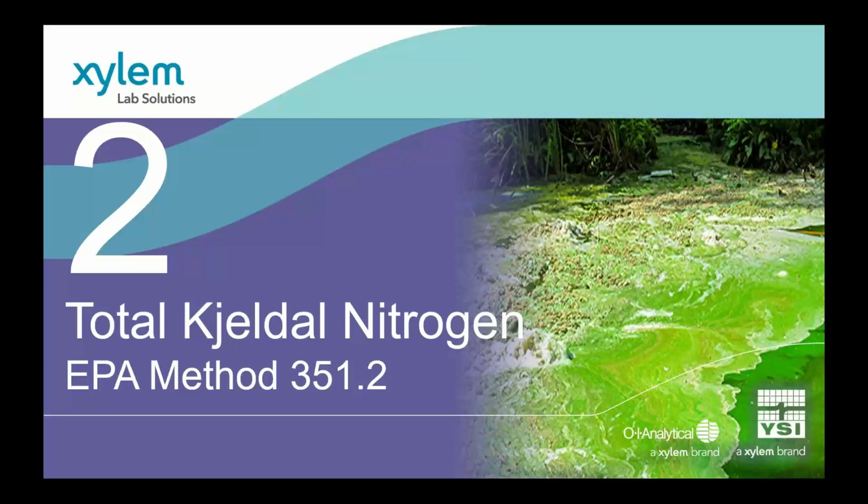So I will be focusing a lot today on EPA methods. And that's not just because I'm in the US, it's also because globally, a lot of people start with these methods, and these are methods that get adapted in a lot of different regions. There will be some exceptions to that, particularly when we talk about geosmin and MIB.